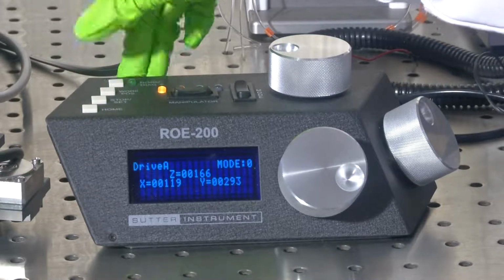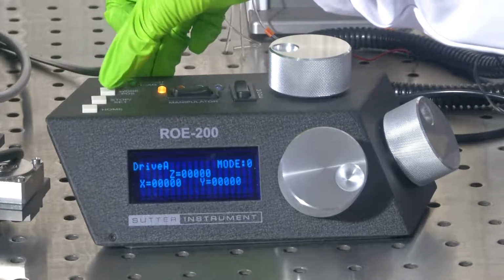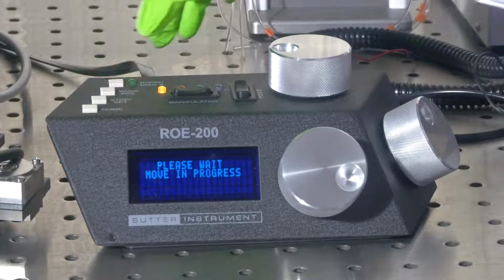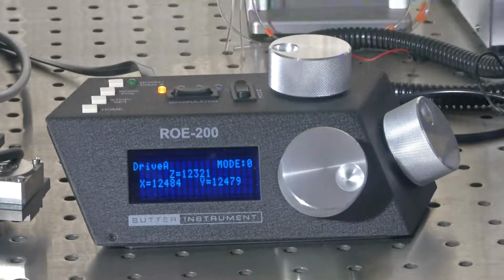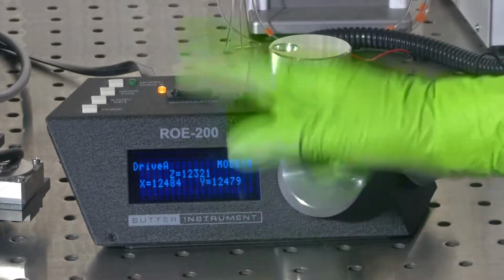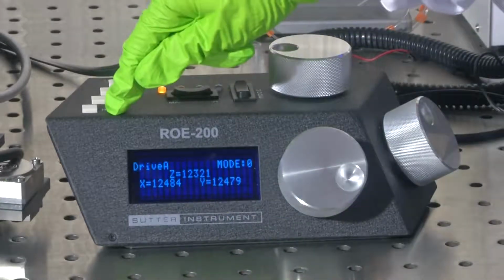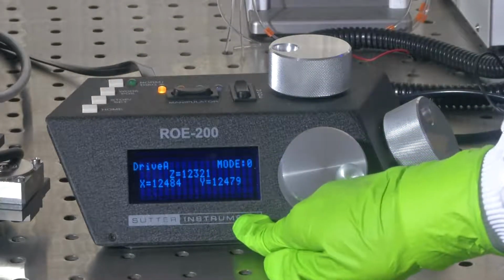Now, this would be saved as work position. You could always go back to home, and this is the home button, and then I come back to work position. As you can see, the set values are being displayed. The previous one, what I did, was not saved, but this was the previously saved work position. I just moved to home and then came back to work position, and you could see the saved position.